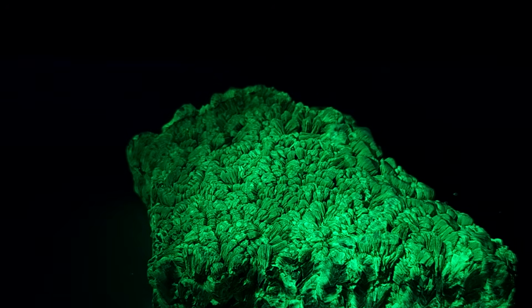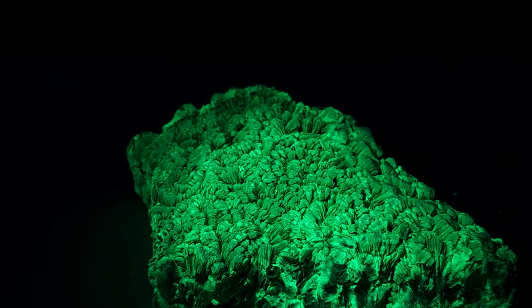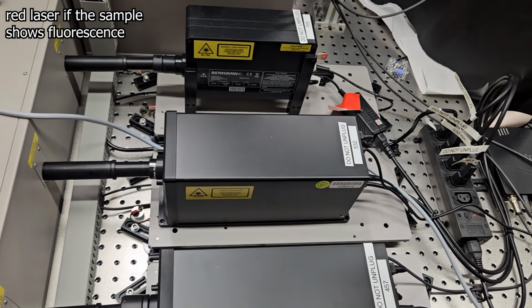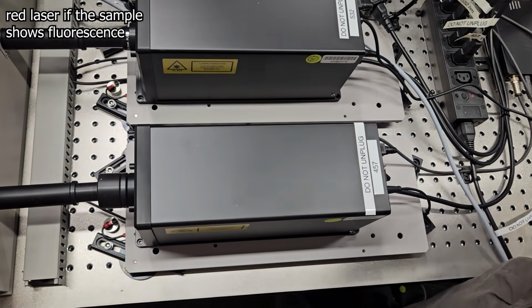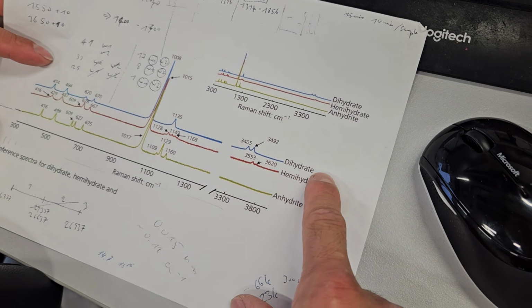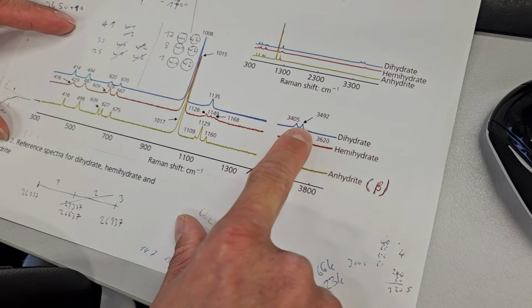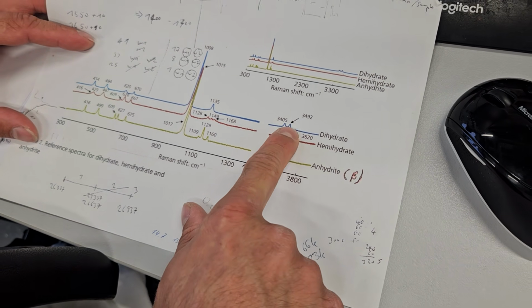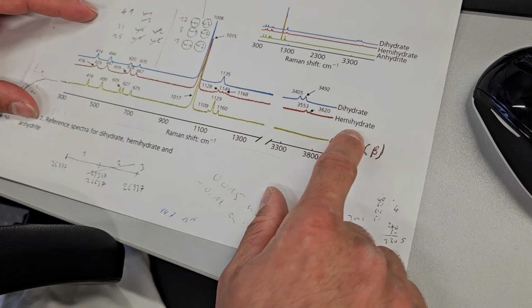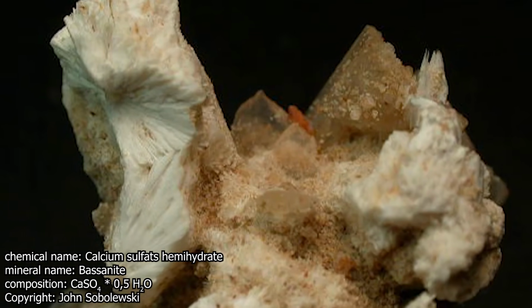It is also possible to analyze fluorescent minerals. However, this typically requires switching to a different laser, specifically the red laser, which must first be allowed to warm up for about 15 minutes. Furthermore, the degree of hydration of a compound can also be determined, whether for a chemist it's a trihydrate or a tetrahydrate, or in the context of mineralogy, whether the sample is calcium sulfate dihydrate, hemihydrate or anhydrate. These represent 3 distinct minerals: gypsum, bassanite and anhydrite.